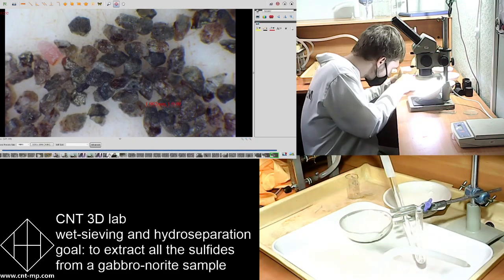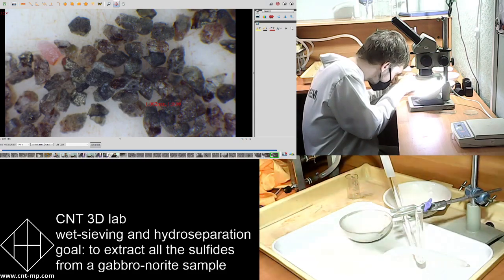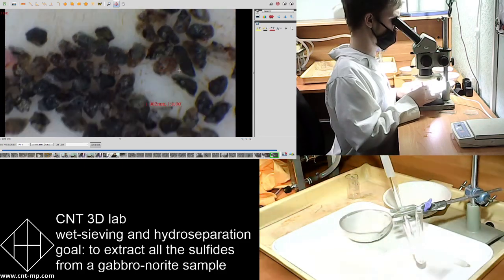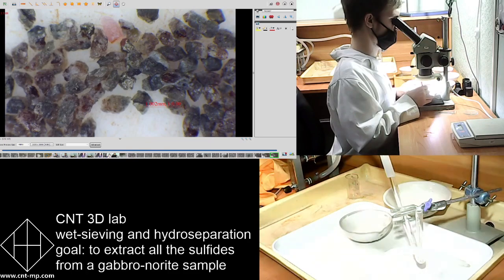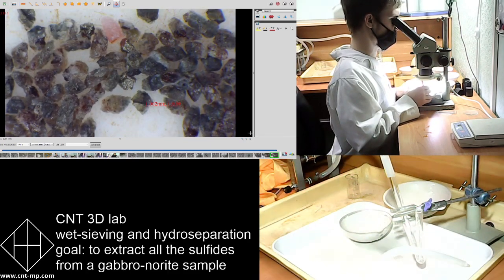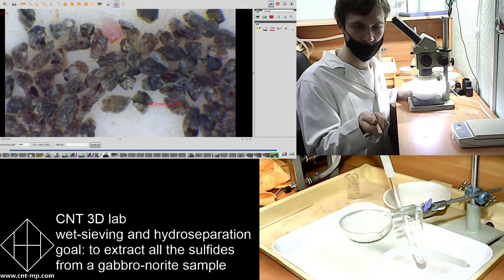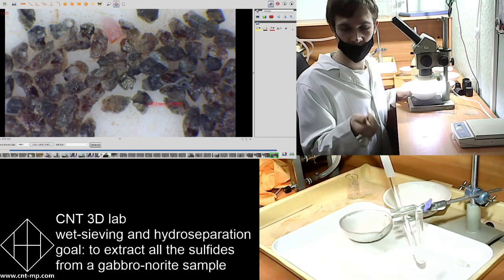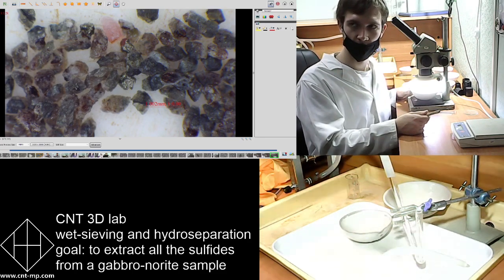Definitely, this will be a very good result that we'll then be able to evaluate, and the client will be happy because he could do any mineral processing on these samples because of this density and hardness and compactness and fine grainedness. So you can see these crystals, these particles are all separate grains, separate minerals, which is very good. There are some intergrowths as well, but that is a coarse fraction. Just wait and see what we'll be getting from the fine grain fraction.